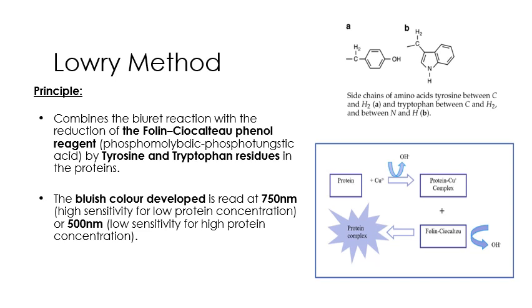This complex then reacts with the Folin-Ciocalteu reagent, leading to the release of a hydroxide group, and then forms this colored protein complex with the Folin-Ciocalteu reagent.